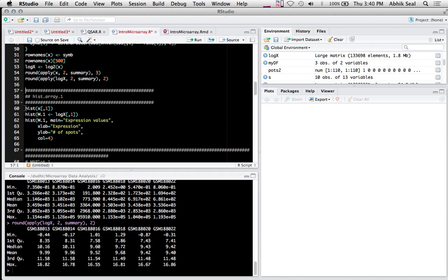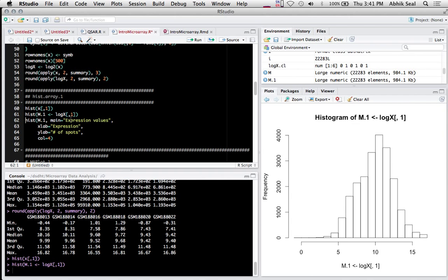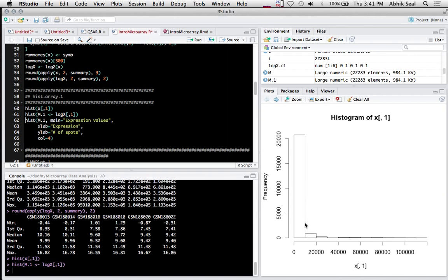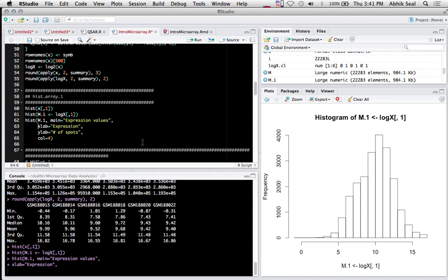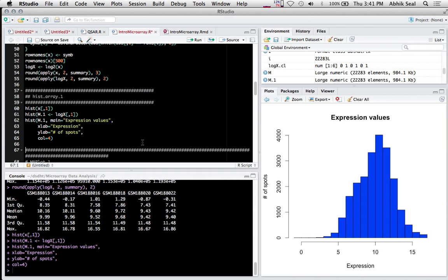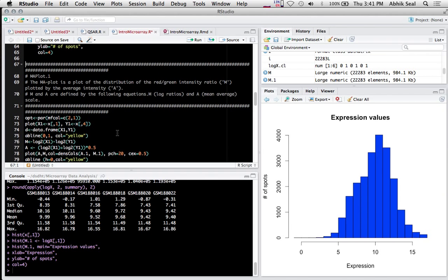If you want to plot the histograms, you can see here the log of expression values. The first one is very skewed, and log actually normalizes the data. There are other ways of doing normalization, but most people use logs for data normalization.